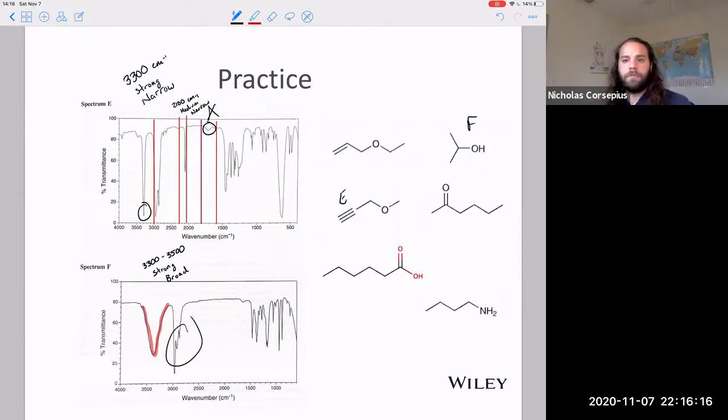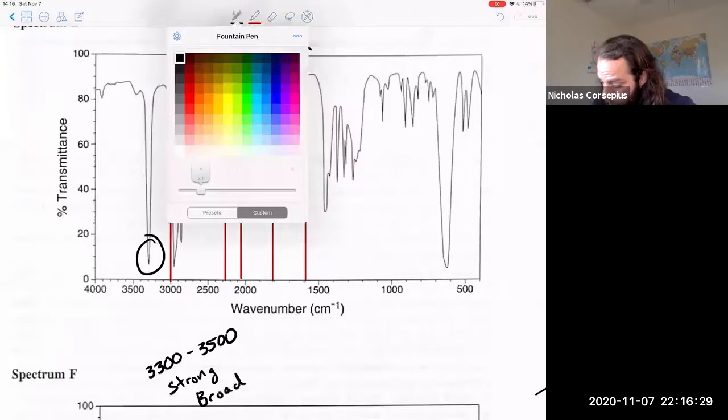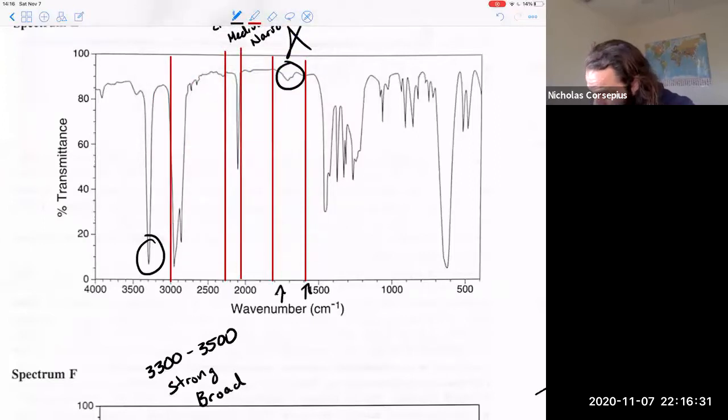There's a table in your book that tabulates that this functional group has this particular absorbance. Notice how I specifically didn't use it here. I think the most important thing is to remember these lines where you need to lay down your markers for the double bond region, for the triple bond region, and then at 3000. What I'm trying to say is don't get married to this table. First of all, you're not going to have it on the ACS exam.